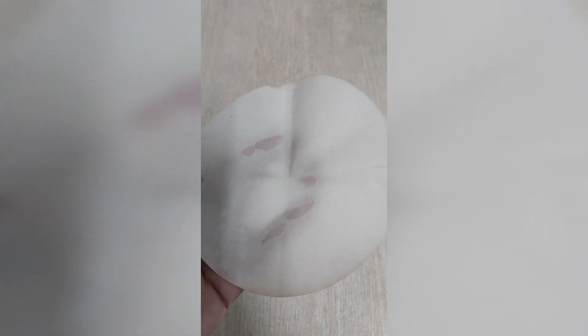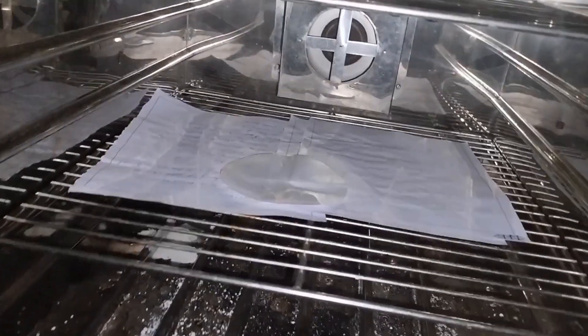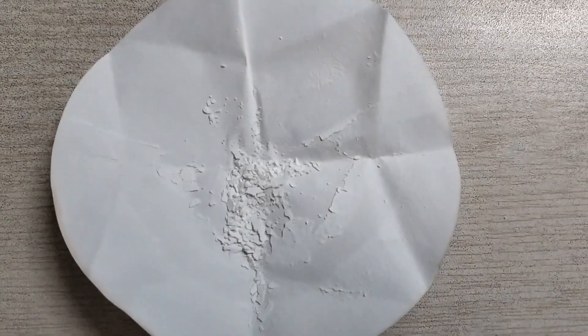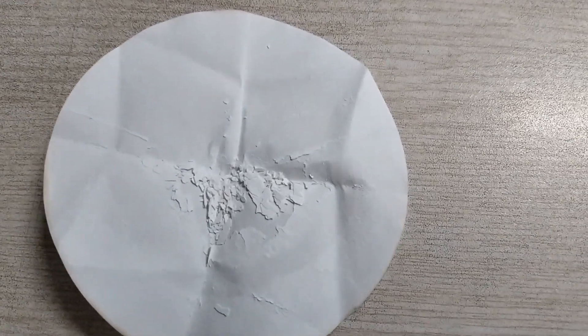Then the obtained micro sponges are put into the oven. After 12 hours, the micro sponges are completely dried, and here are the prepared micro sponges.